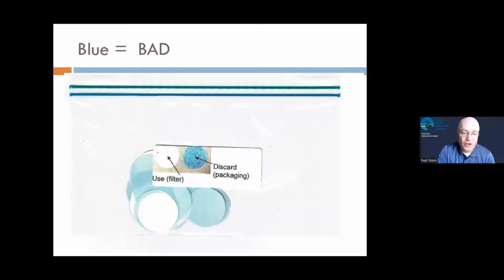They are fully opaque. This is why it tricks people up. The filters you actually use are fully opaque, and they may not look like what you think a filter should look like. And people look at the blue, somewhat translucent piece of paper and think, oh, that looks more like a filter, so they use that. So it's tricky if you forget this training. It's obvious right now, but in a month, when you are just doing this independently, you may forget. So that's why I make such a big deal about it.